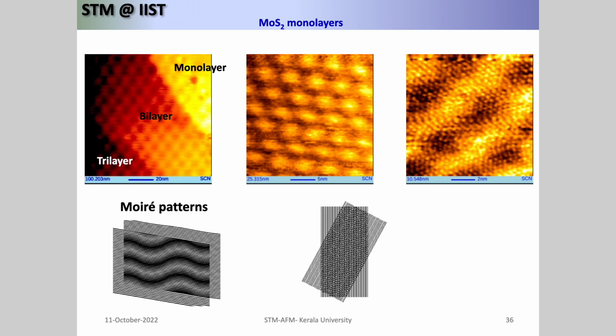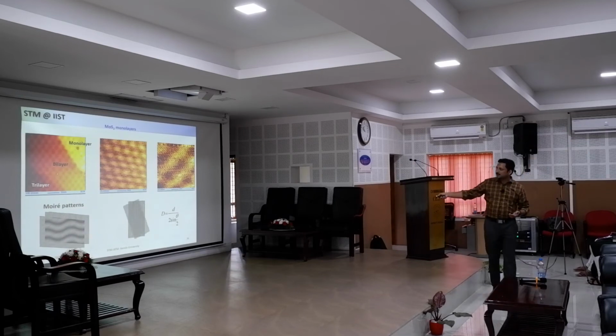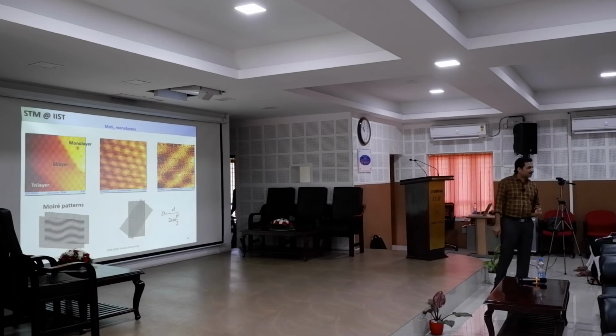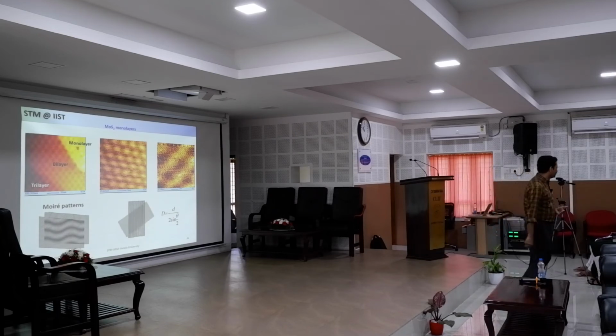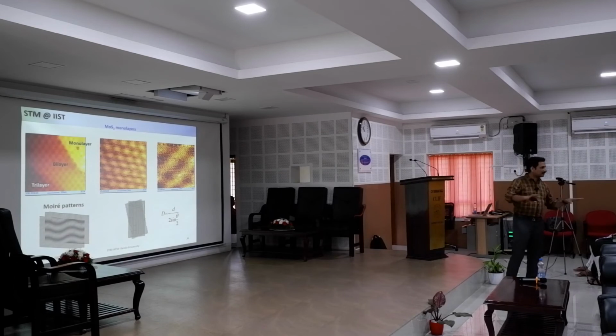These are not atoms; these are electron localizations. Localized electrons, because electrons are waves, right? So we are actually taking the waves of electrons. We are measuring the waves. So they also have this interference with the atomic lattice. If you see beautiful lattice images, but the distance is large, much larger than an atom, it's called a Moire pattern. That means electrons are localized here. Instead of spreading all over, there are fewer electrons, more electrons, fewer electrons, more electrons, like that localization.